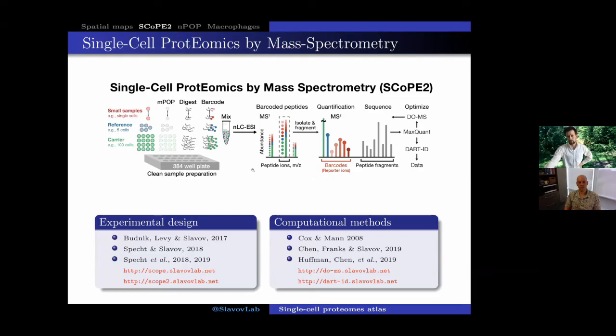And then we perform LCMS analysis. We have tried using low flow and some of the top performing chromatographic columns and other approaches to enhance sensitivity. But for the most part, most of our data we generate by using relatively standard 75 micron inner diameter columns. We prioritize robustness over squeezing the ultimate performance out of the system, while there is certainly great value and virtue in also squeezing the ultimate performance. We just generally prefer to operate in the robust mode of generating large amounts of data.